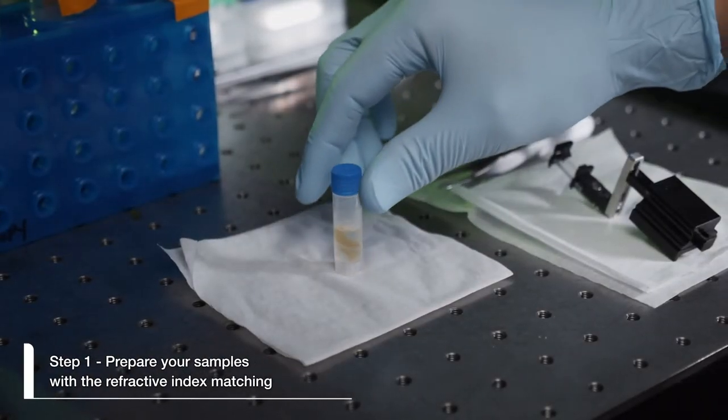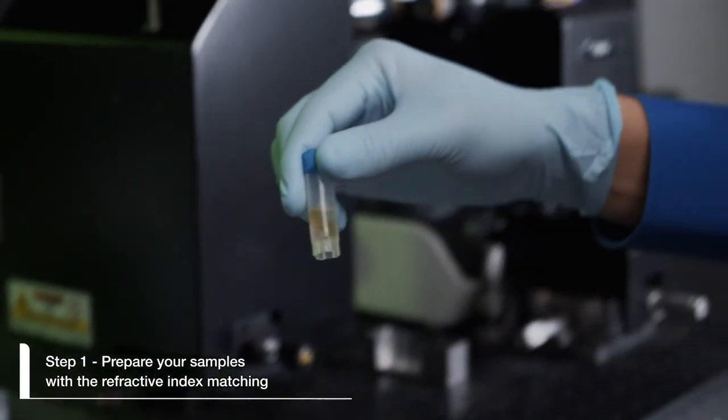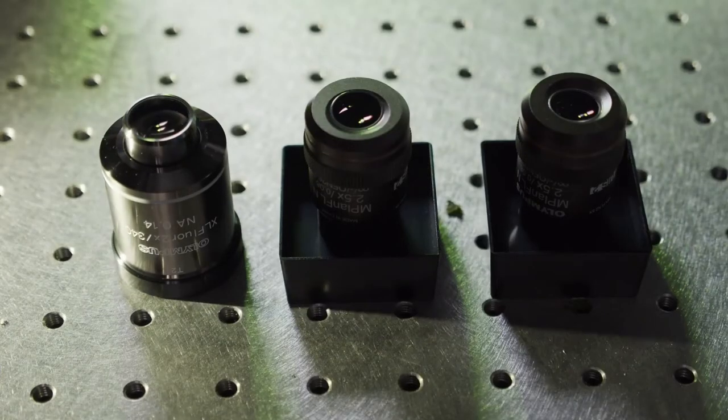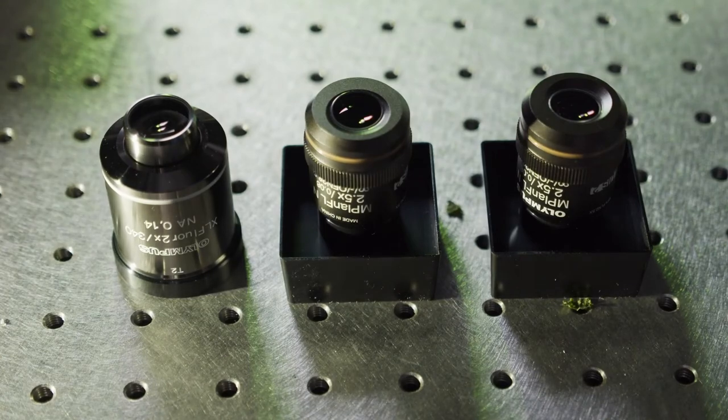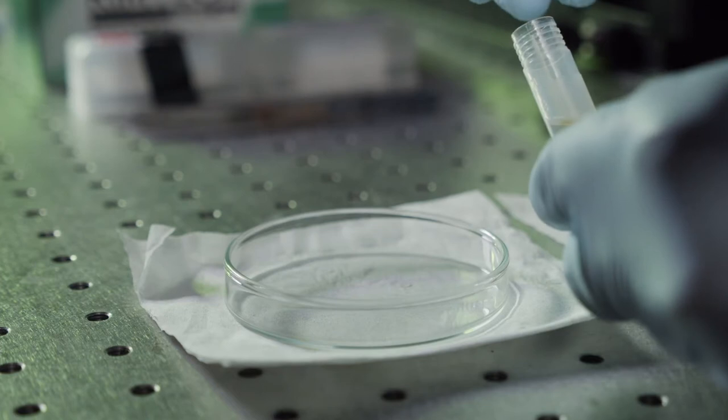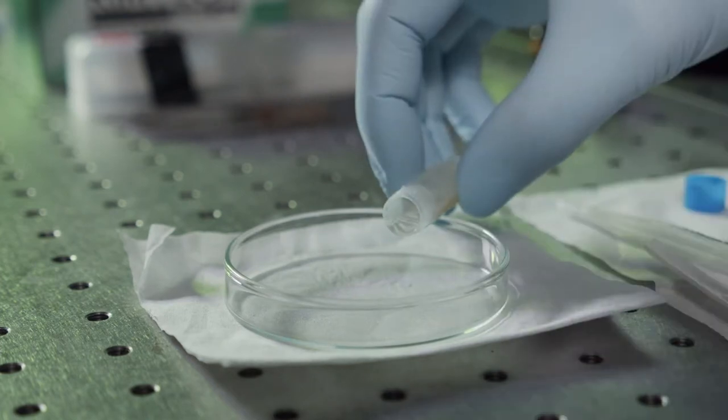Step 1. Prepare your samples with the refractive index matching, whether it is cleared or live, and choose the objective sets for both illumination and detection. In today's case, we're going to look at the cleared liver tissue sample with RI of 1.46.